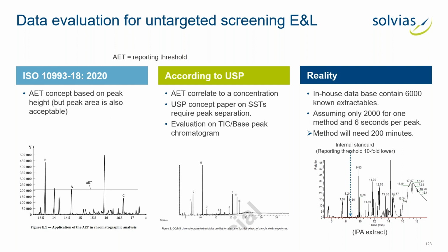So I have my problems to put both ideas together. Yes. Another requirement from the USP is, for example, that we get peak separations. We have a database of only 6,000 extractables, leachables that can come from plastic products.